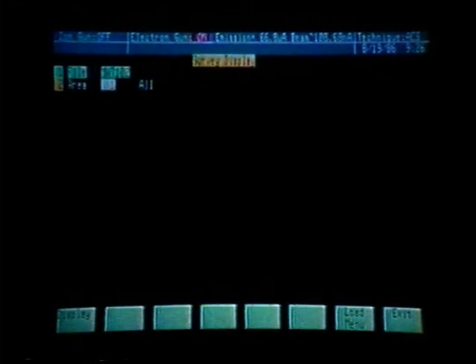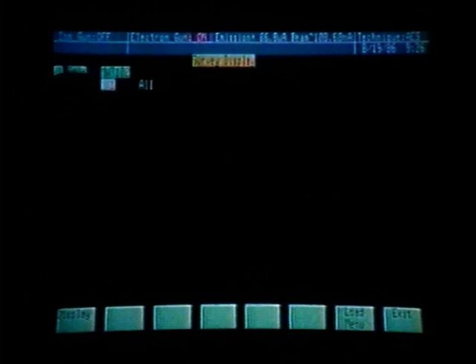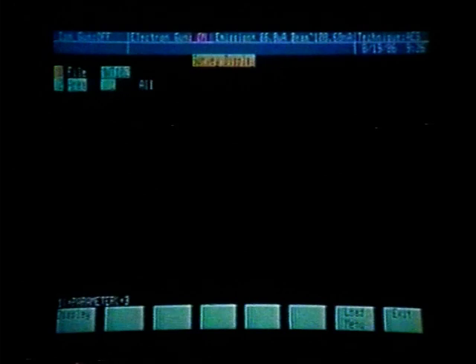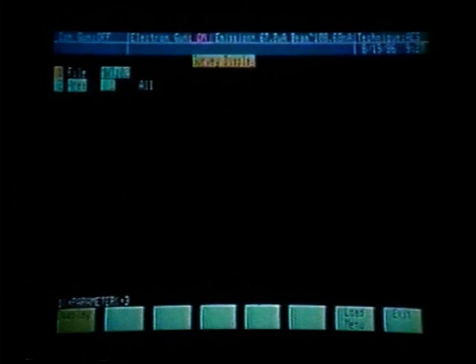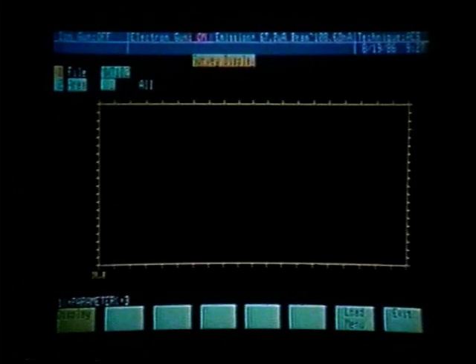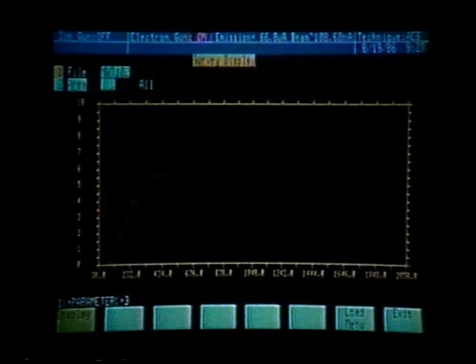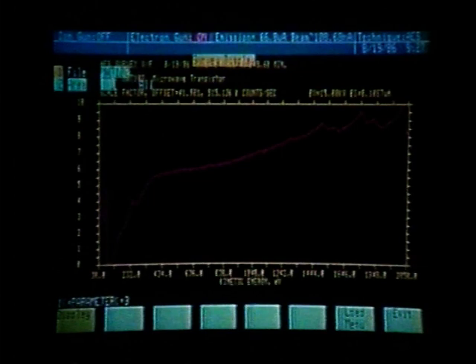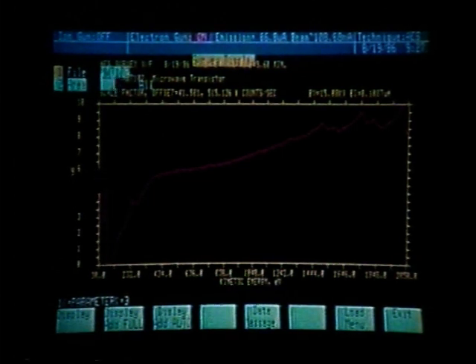In pressing function key 16, we now enter the survey display menu. We see that the file is MWT102, which is our survey scans. Function key number 2 allows us to enter the area we wish to display. Let's take a look at area number 1. By pressing soft key number 1, it will automatically display area number 1. Now that we have area number 1 displayed, our soft keys take on different functions.